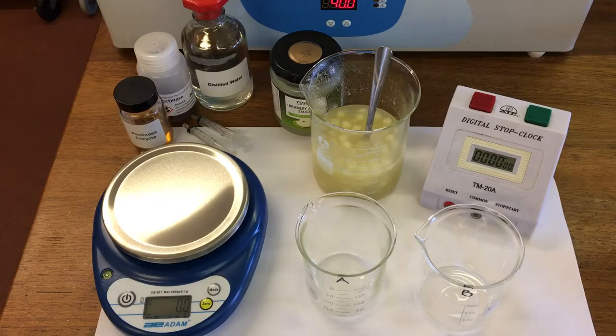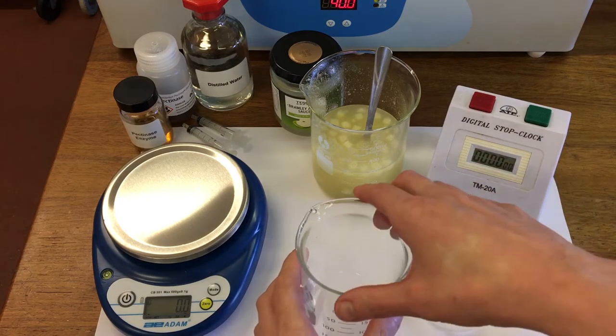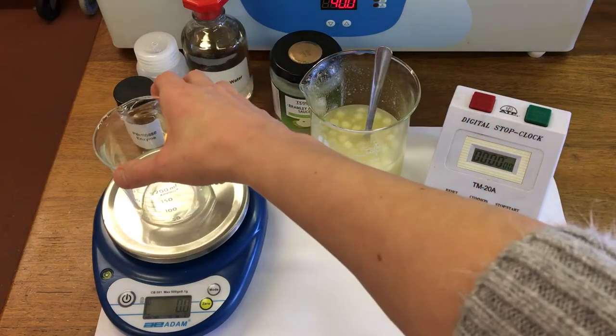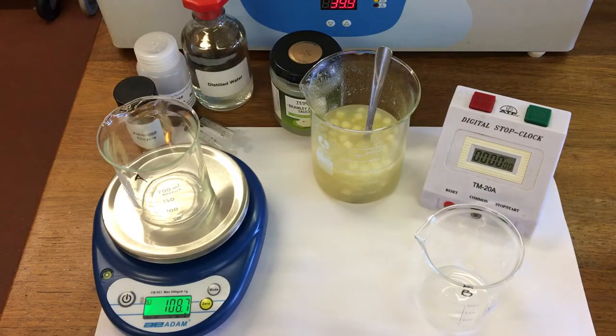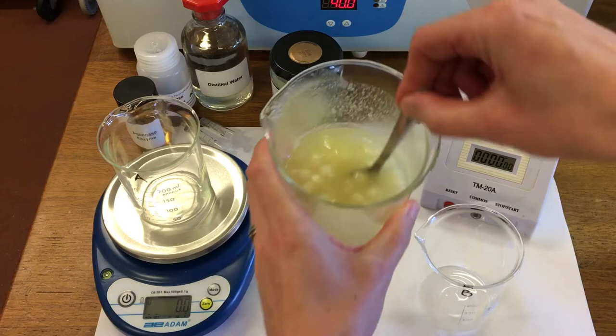In this experiment we're going to look at the effect of enzymes on apples. I'm going to use the enzyme pectinase and I'm going to use some apple puree. First of all I'm going to measure out 50 grams of apples into each of our beakers. So this is our applesauce here.